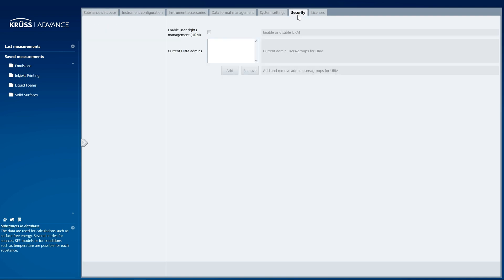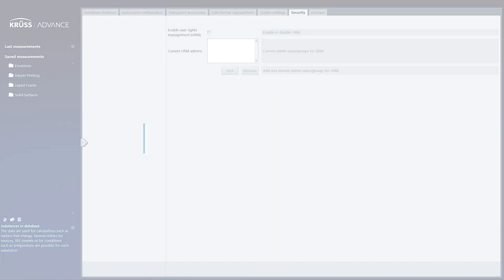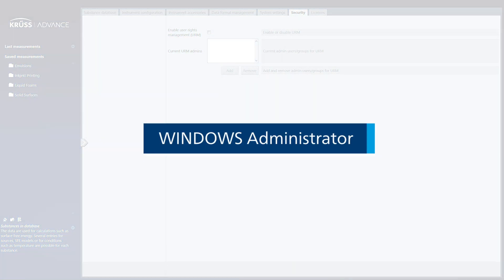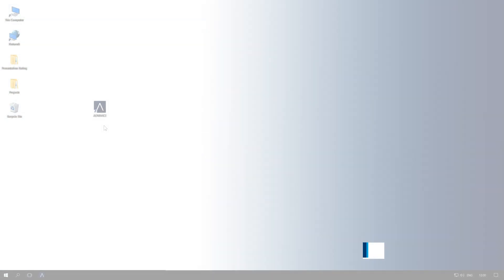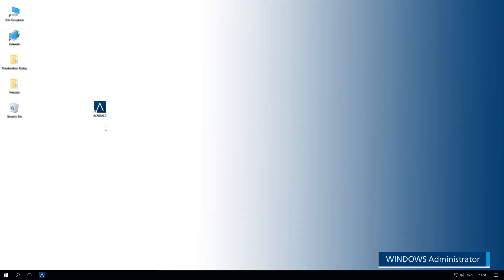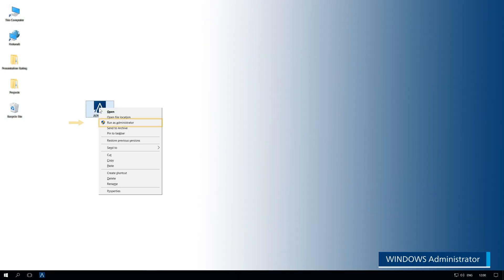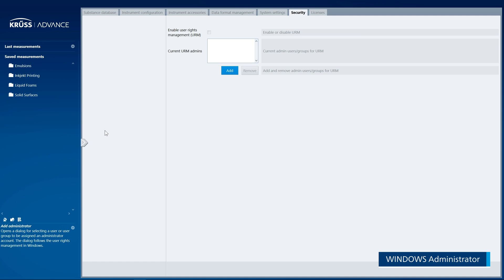In order to use User Rights Management, it is first necessary to create an Advanced Administrator. To illustrate this, we will switch to the Windows Administrator view. Start Advanced with the Run as Administrator option. To do this, you will need Windows Administrator rights.